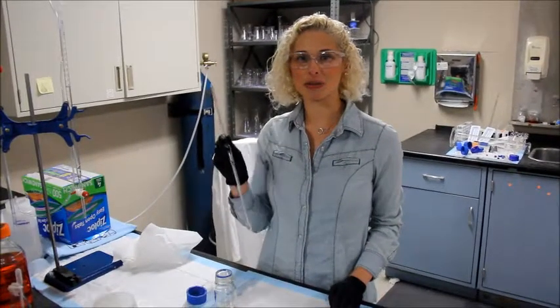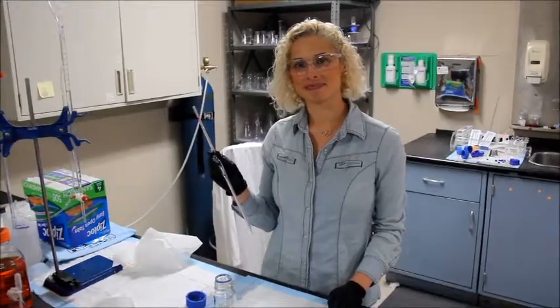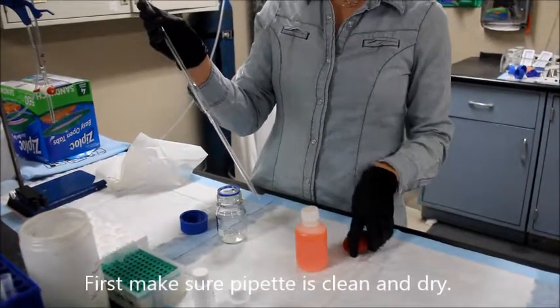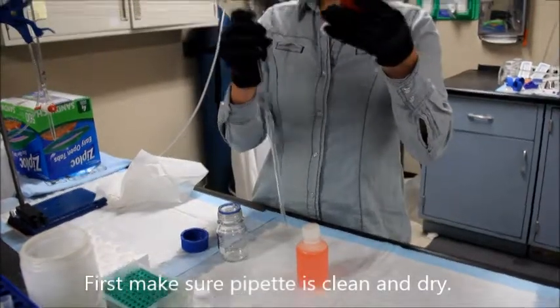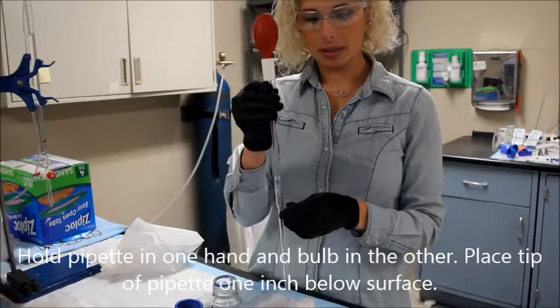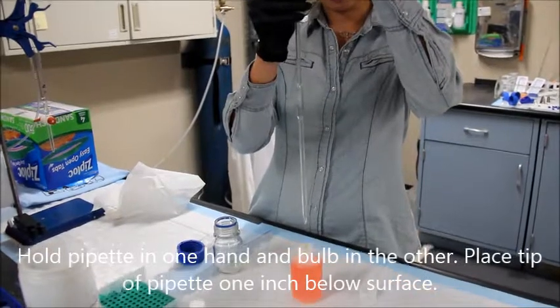I'm going to show you how to use your volumetric pipette accurately and precisely. Just make sure the pipette is clean and dry before use. Hold the pipette in one hand and the bulb in the other, and immerse the tip into the bottle so the tip is about one inch below the surface.